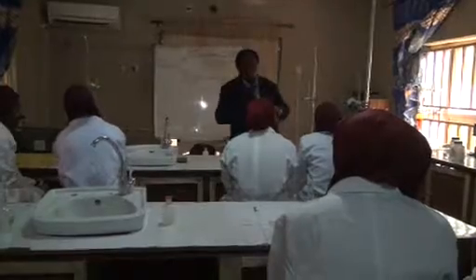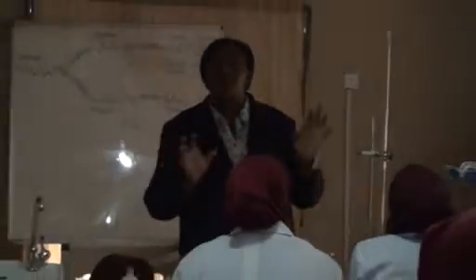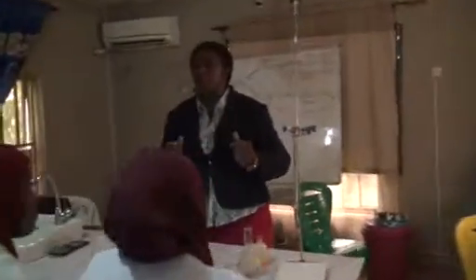Now take your readings from the lower meniscus. The liquid, which is the acid, is going to be curved. Take it from the lower meniscus and take your readings at eye level to avoid parallax error. So these are few of the rules that you are to observe. Use your safety goggles to also ensure safety, and you can now continue with your practical.